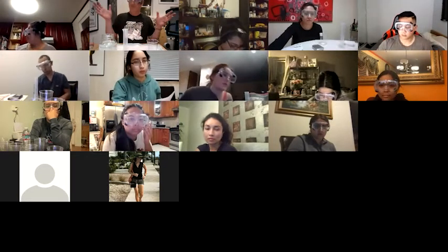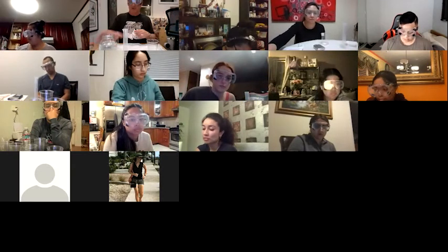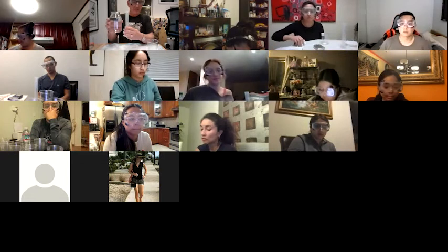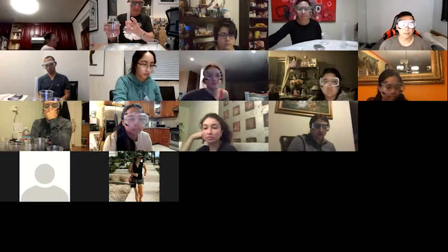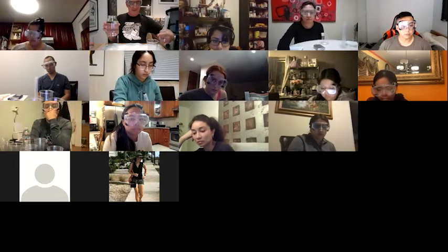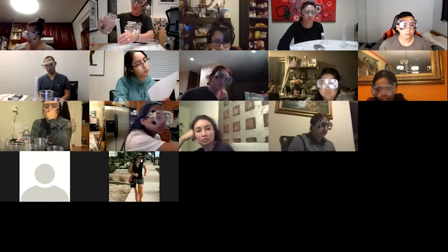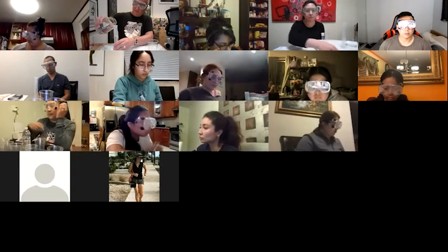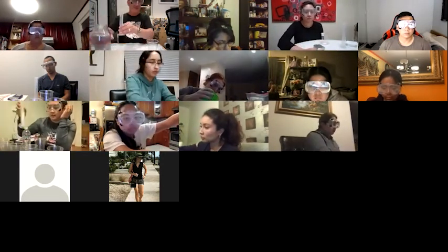It's a little colder than room temperature in here. And I'm not going to be able to measure the volume as accurately as the balance is going to be able to measure the mass. So I'm not going to be too fussy about getting exactly 50 in here, but I'll pour about 50 in here.